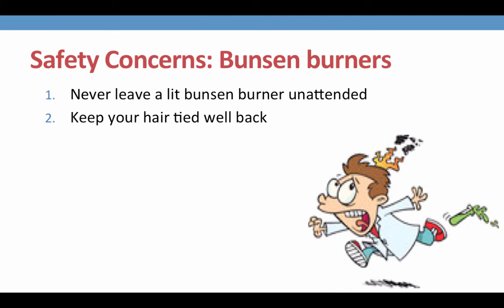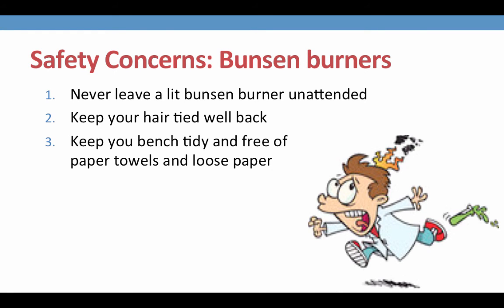And then, as I mentioned, make sure your hair is tied well back. So if you have really long hair, simply putting it in a ponytail is not enough because that ponytail can fall forward into the flame. So put it up into a bun or pigtails or whatever you need to do to make sure that your hair stays behind your face. Also, it's a good idea to keep your bench tidy and not to have random bits of paper that could combust lying around, such as paper towels and loose paper.